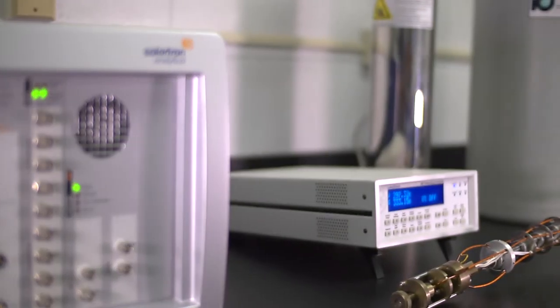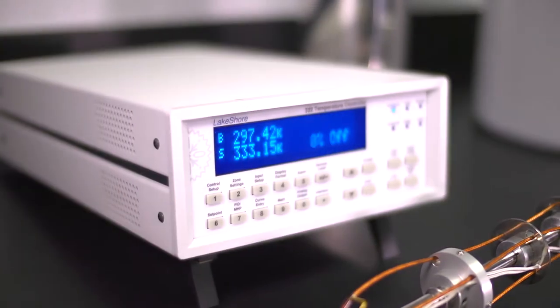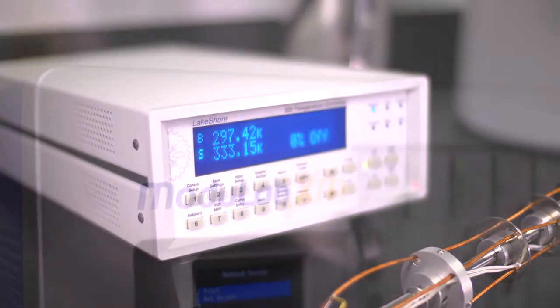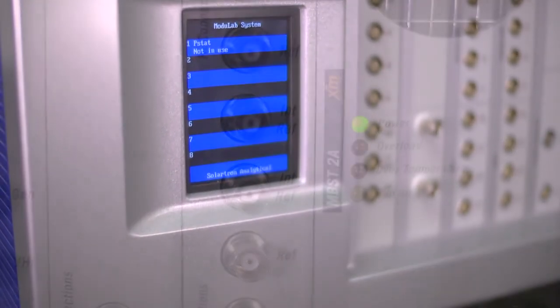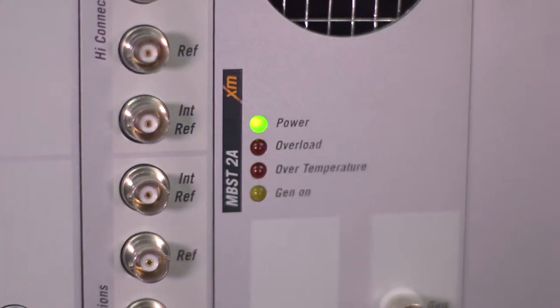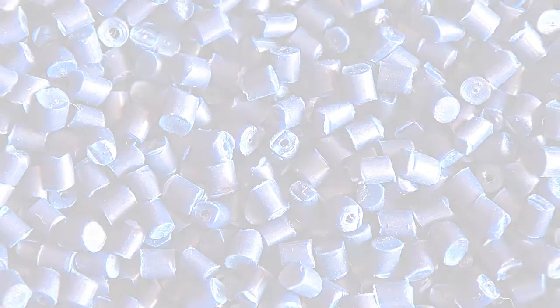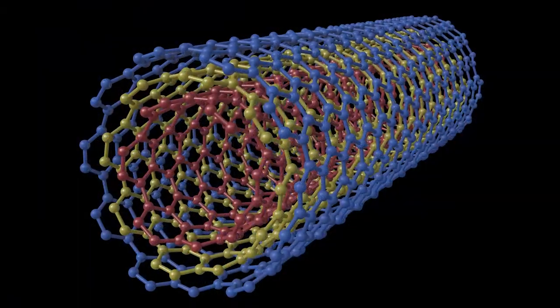Modulab XM-MTS makes use of a range of reference standard modules, including power boosters, high voltage modules and differential voltage auxiliary inputs to address the most advanced characterization for the latest generation of materials, composites and nanostructures.